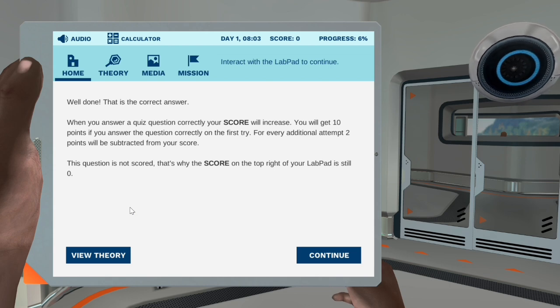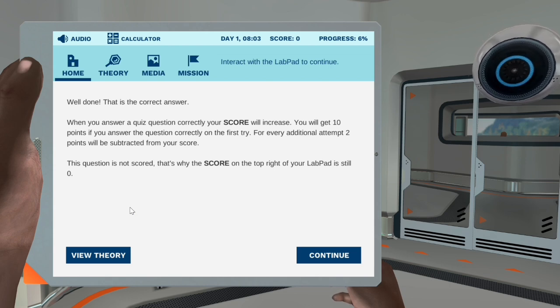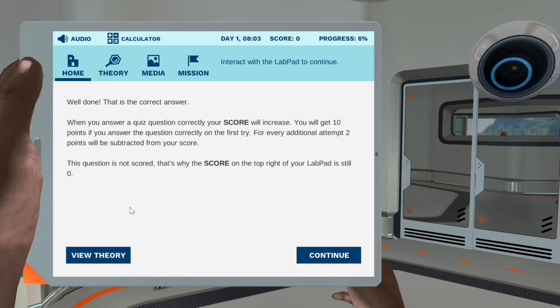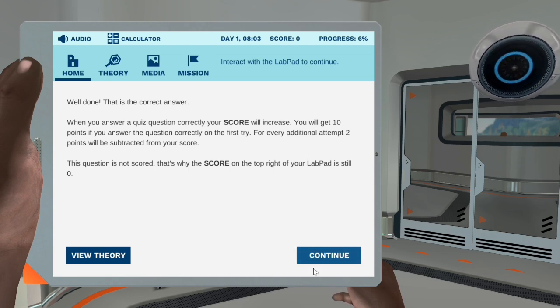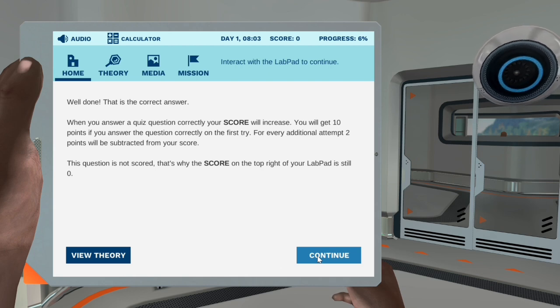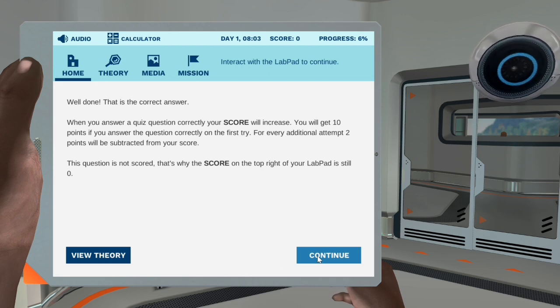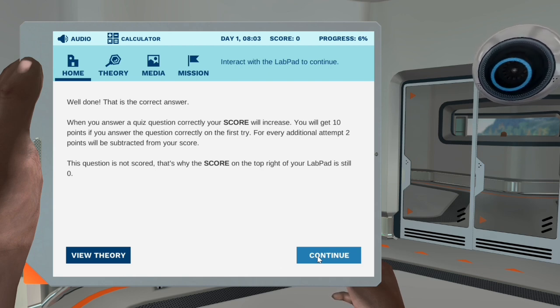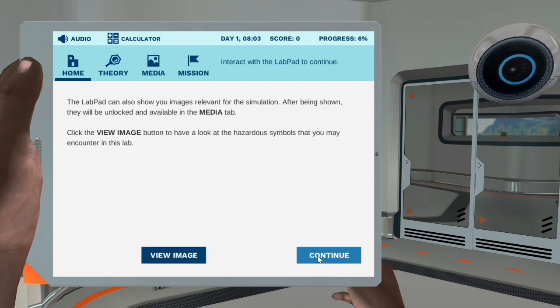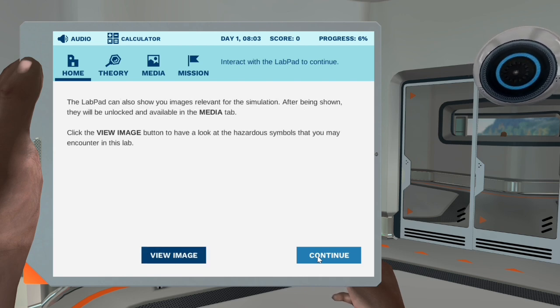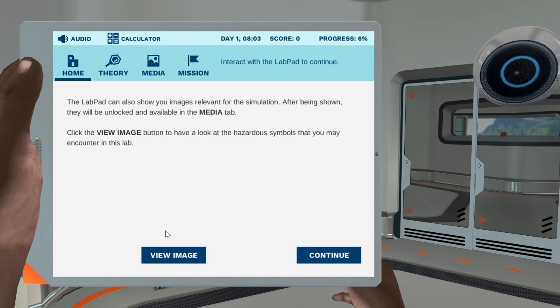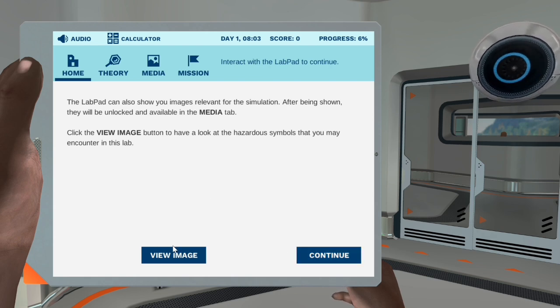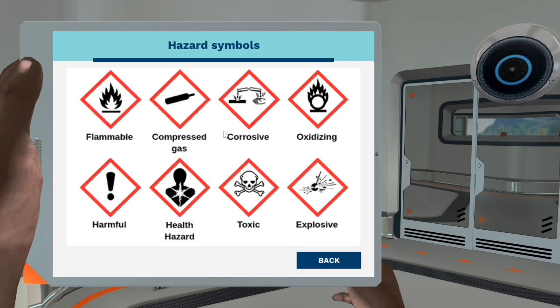If you ever get stuck somewhere, you can click me for help. During the simulation, I will ask you multiple choice questions with four options — only one is correct. Let's try it out. What is my name? Click on the theory tab to find out. Option A: Dronald. Well done, that is the correct answer! When you answer a quiz question correctly, your score will increase. You will get 10 points if you answer correctly on the first try. For every additional attempt, two points will be subtracted from your score. This question is not scored — that's why the score on the top right of your lab pad is still zero.